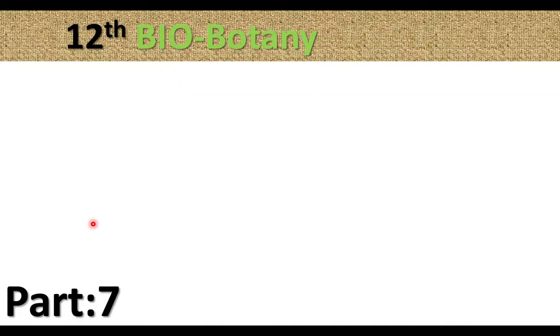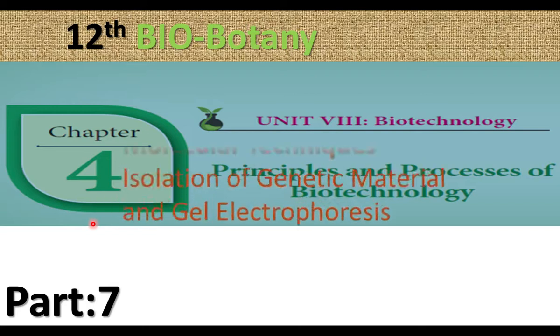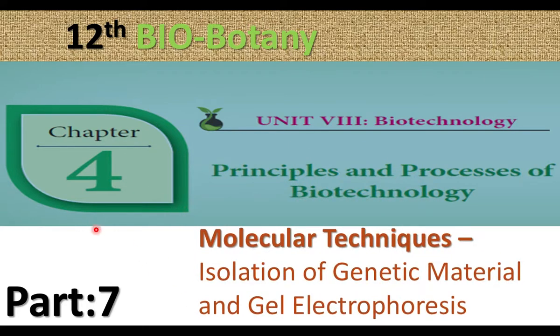12th Bio-botany. Chapter 4: Principles and Process of Biotechnology. In this part, under the heading Molecular Techniques, we are going to discuss isolation of genetic material and gel electrophoresis.